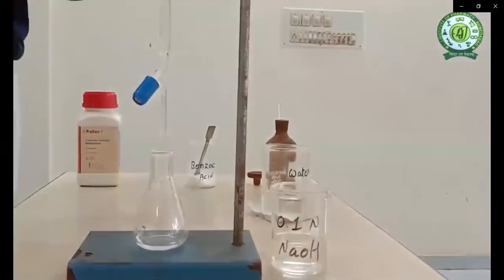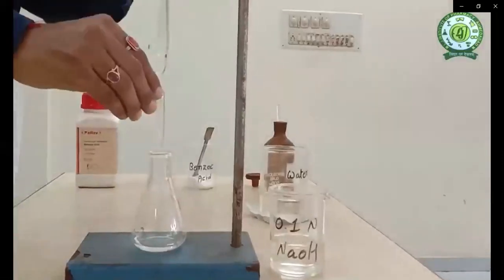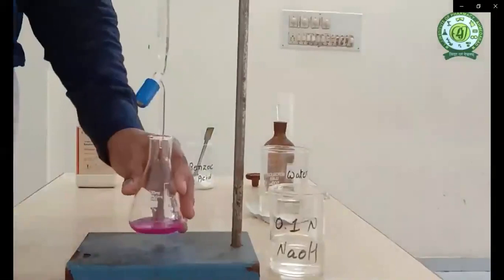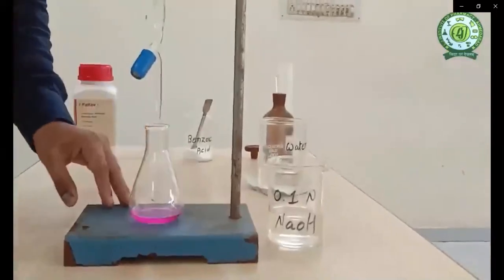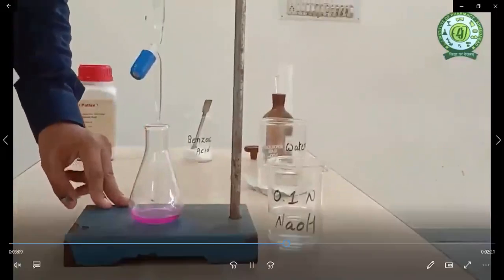As we have already discussed, the end point of this titration is colorless to pink. So now I'm slowly adding the NaOH dropwise to the solution below, and this will be the end point, a clear pink color. Now note down the burette reading. As we have already discussed, we have to perform this experiment in triplicate.